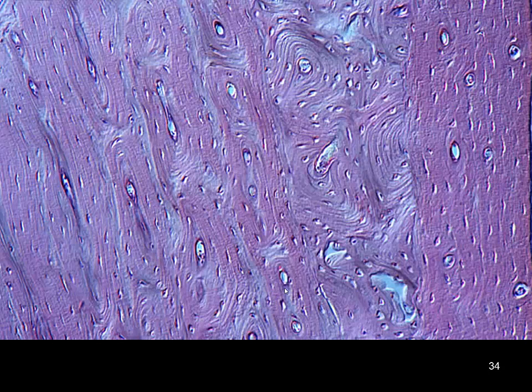Now, this is cut a little bit differently. We're almost getting into our inner circumferential lamellae. You can see how these are streaming along. Here we have some osteons, very sort of abstract in this. You don't see the nice circumferential lamellae in this one. This is going to be a phase contrast image because it almost looks 3-dimensional. But we're still looking at bone, a lot of osteocytes present in this particular micrograph.